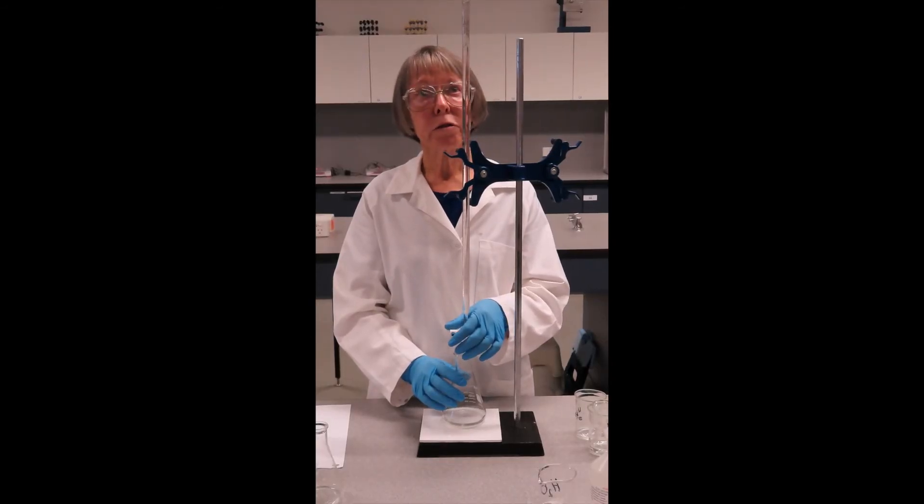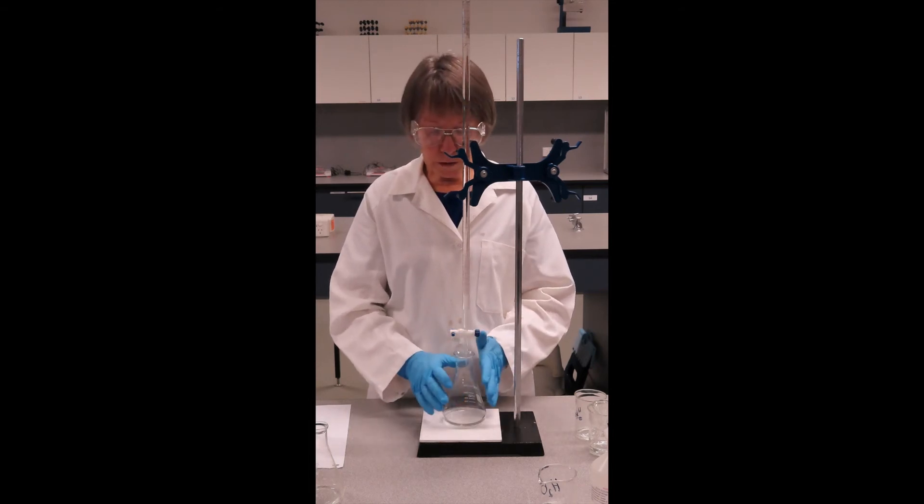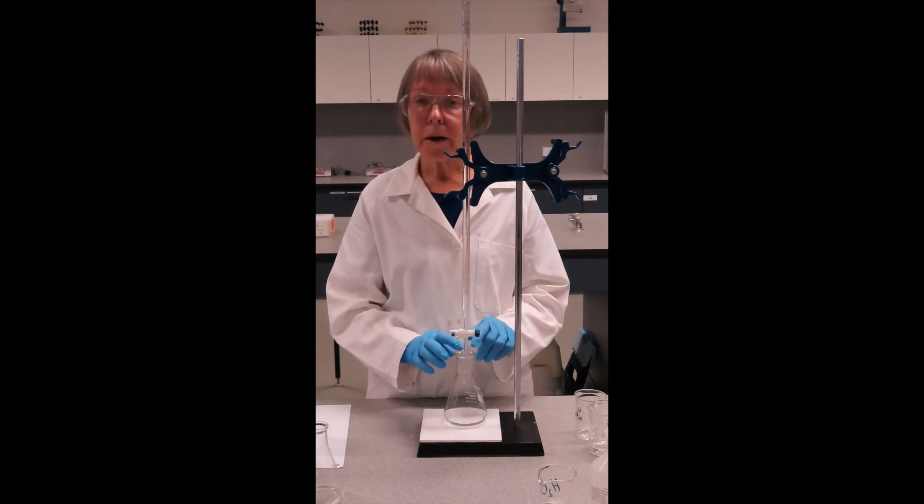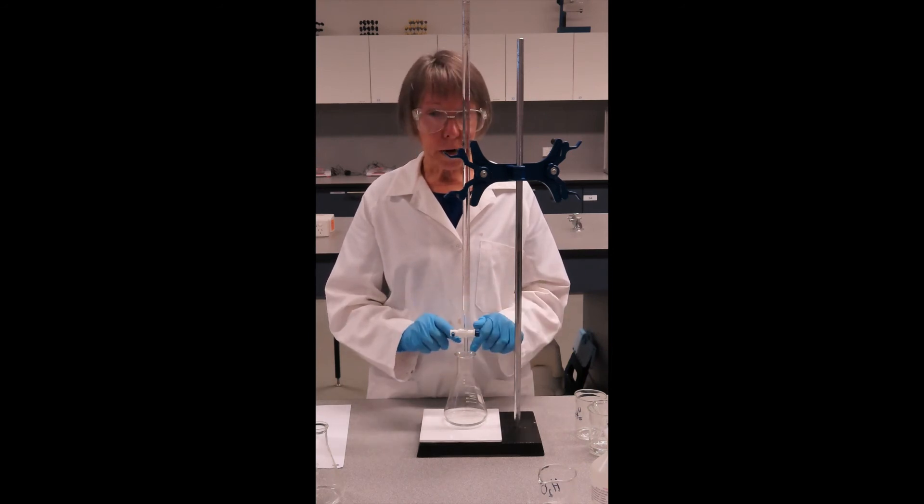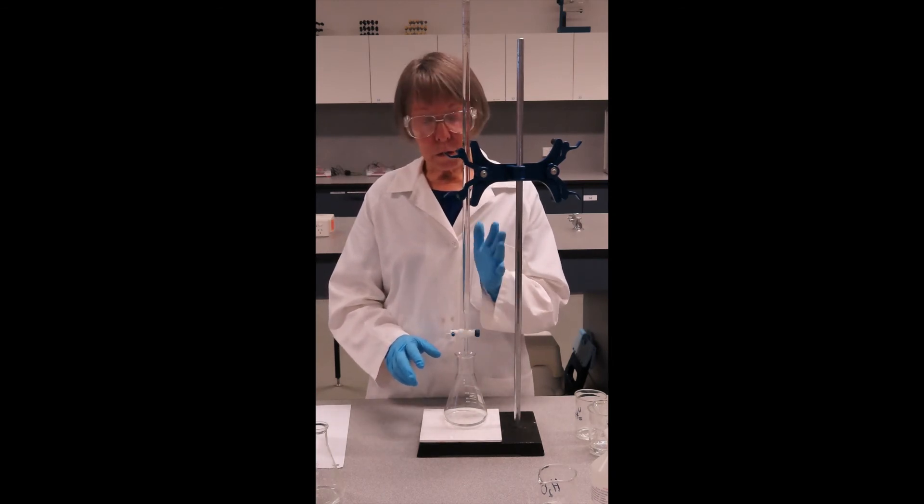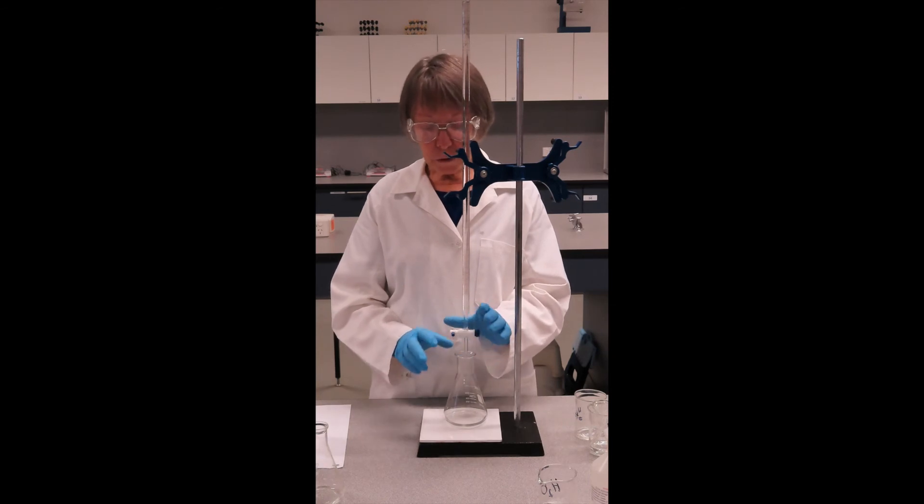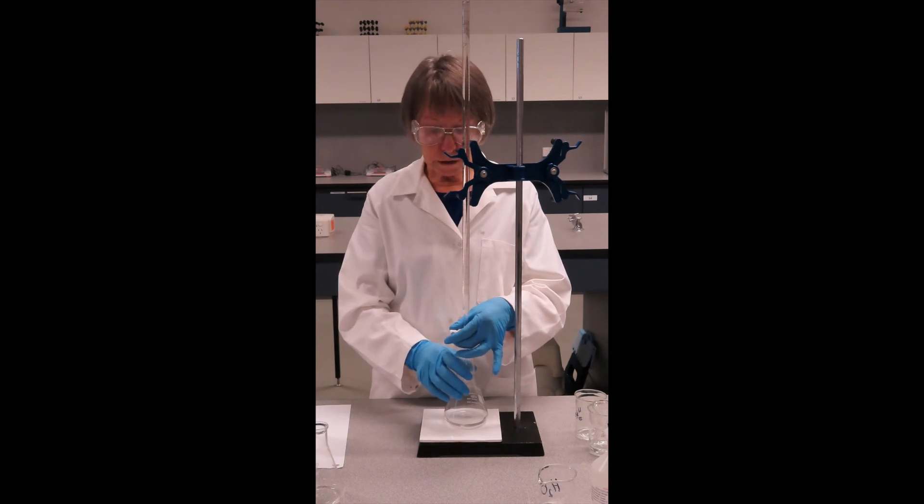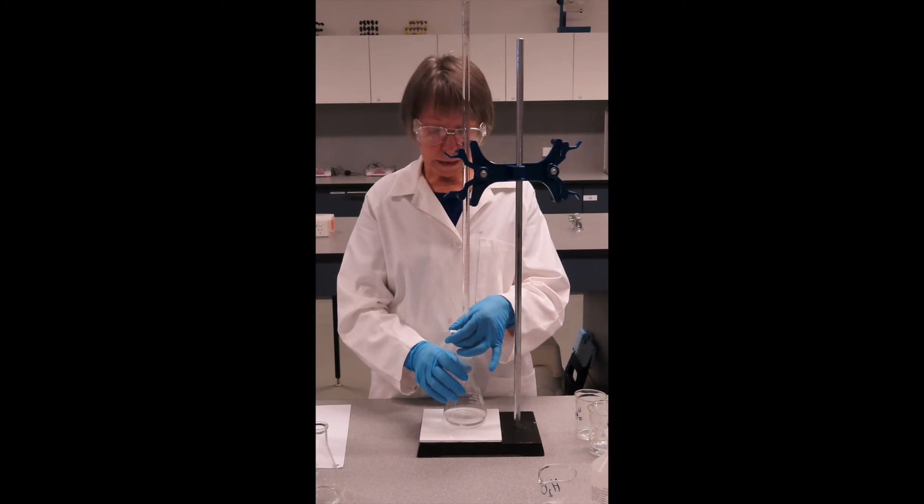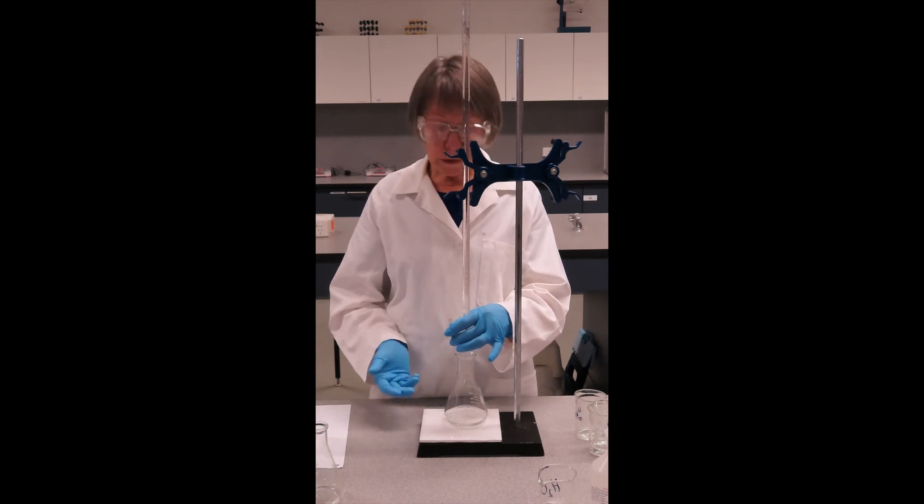I will now show you how to do the actual titration. You'll see that I have my flask underneath the burette. The tip of the burette is inside the neck of the flask, but not too far down. The classical procedure is to use your left hand to operate the tap, so that your thumb is facing you, your fingers are wrapping around the other side. Your right hand will swirl the flask as you run the base in. So the fine tip allows us to add base in a fairly controlled manner. So at the moment I'm simply allowing it to run in.